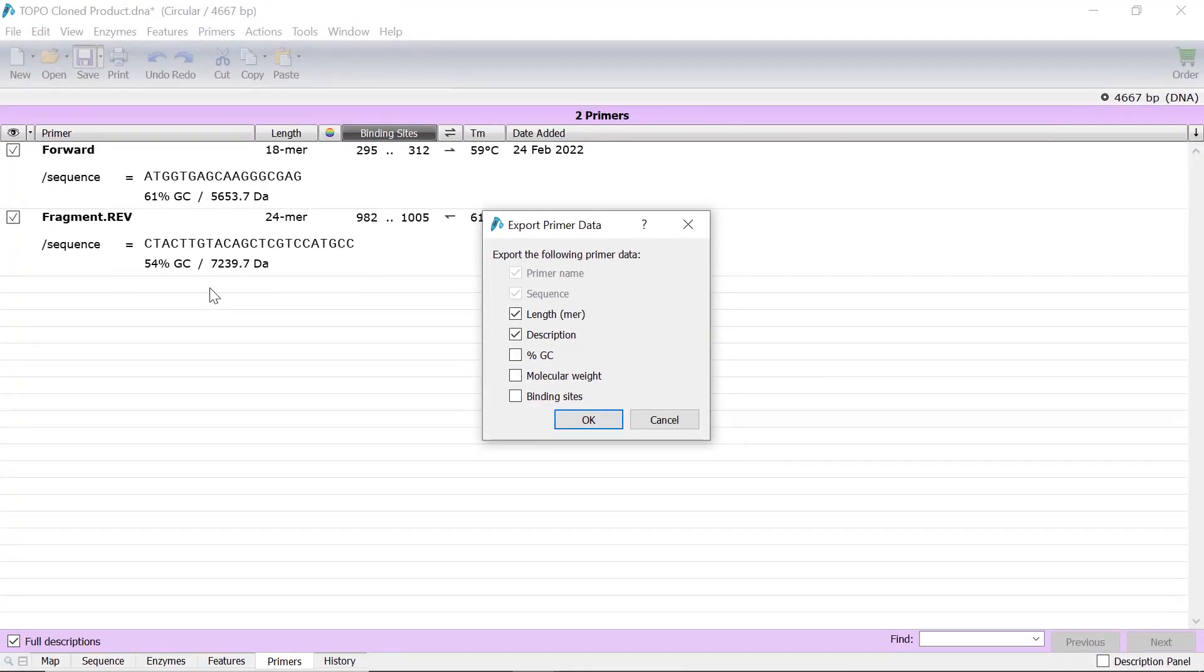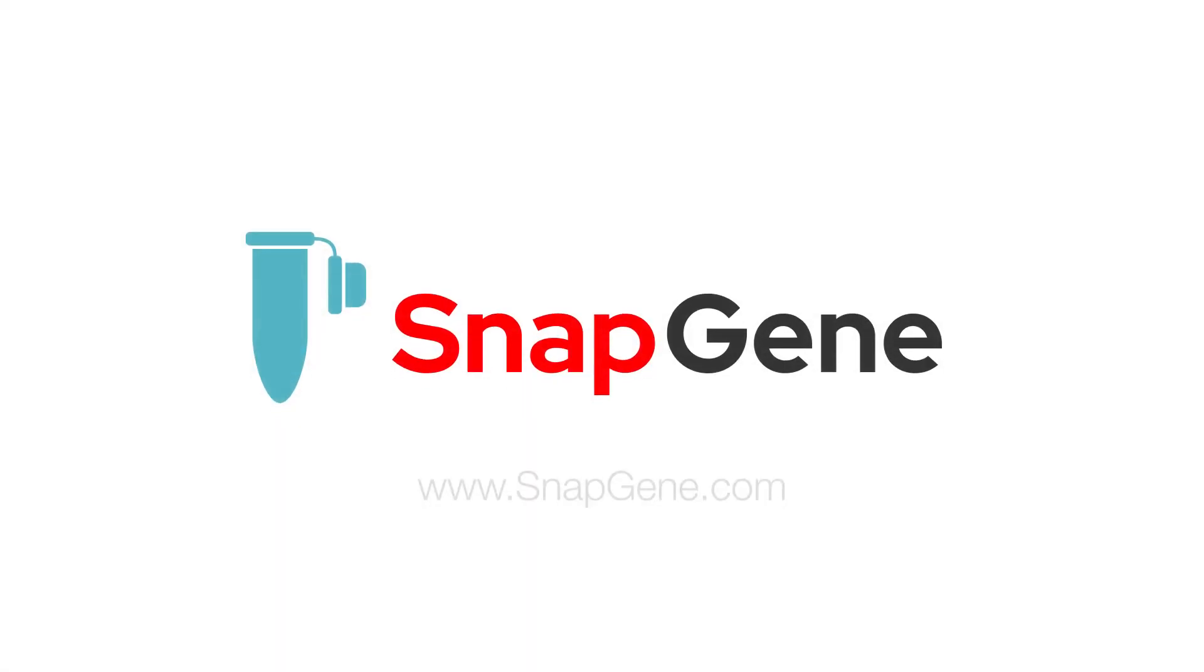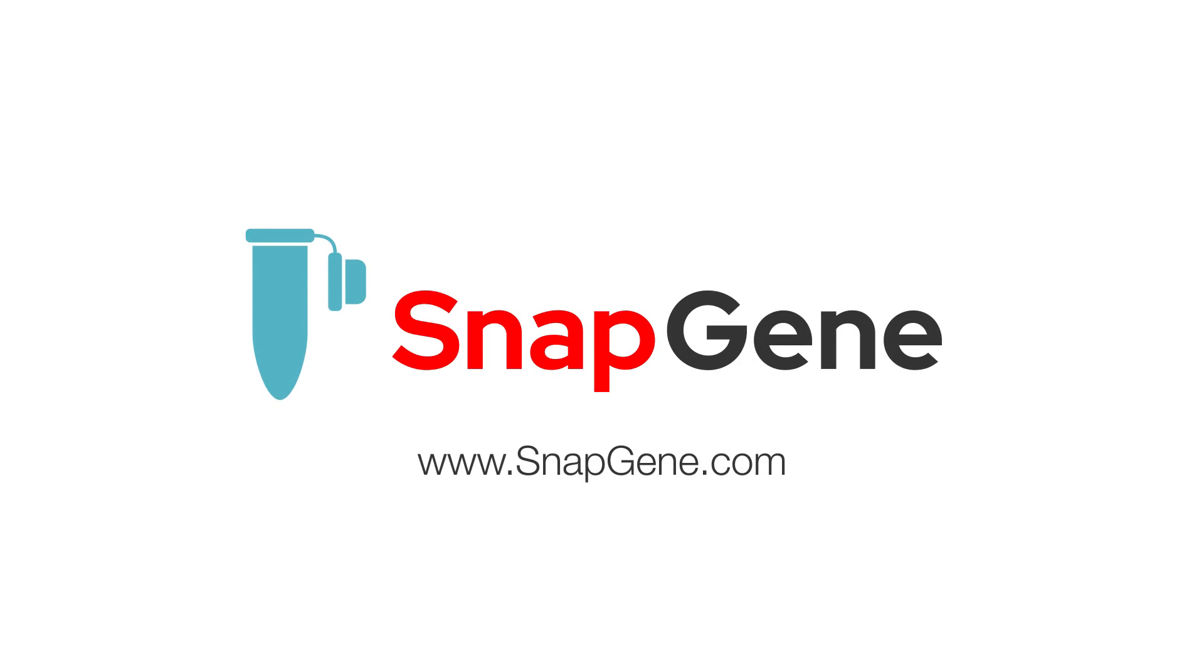Next, select any additional data to export and click OK to save the file on your computer. For more Snapgene tutorials, visit snapgene.com.